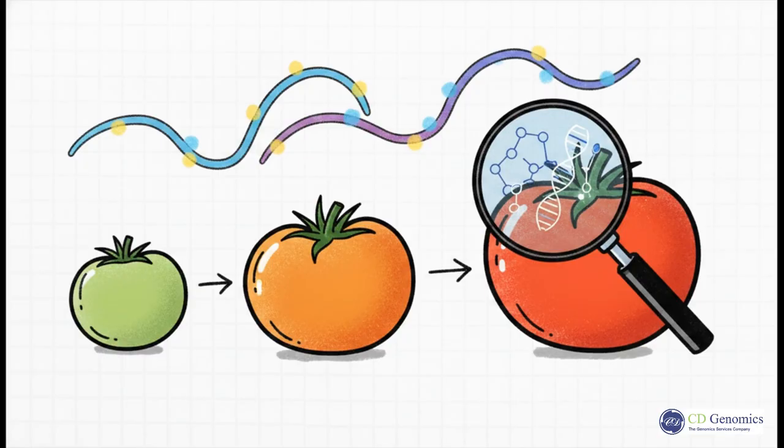And yes, fun fact, while a tomato is culinarily a vegetable, biologically it's a fruit. These researchers successfully utilized MeRIP-seq to map RNA methylomes to understand exactly how these fruits physically change and mature during the ripening process at a molecular level. Their main focus was uncovering the m6A-mediated regulation of a DNA demethylase gene known as SlDML2.